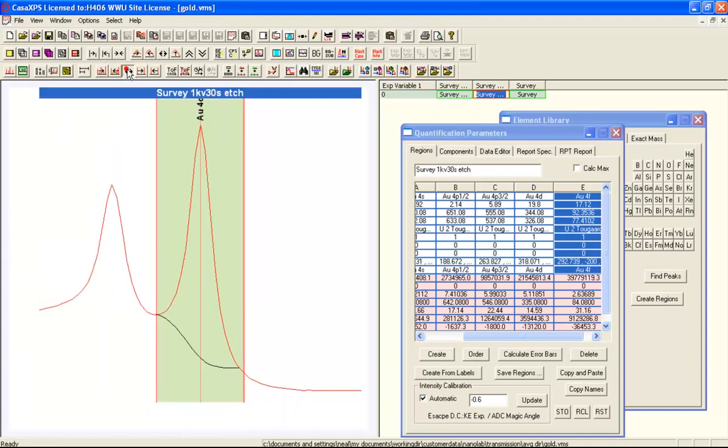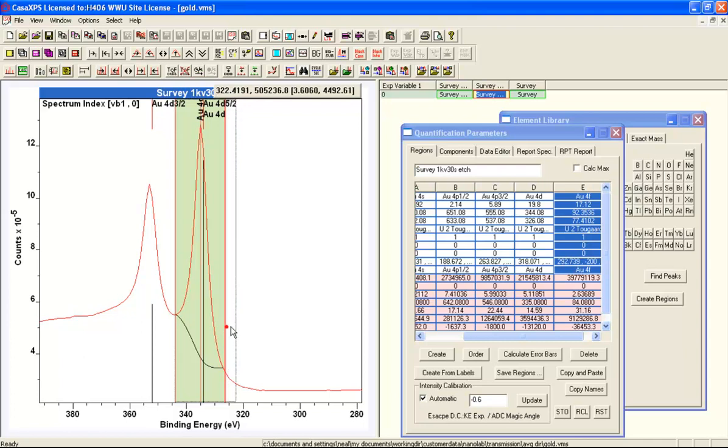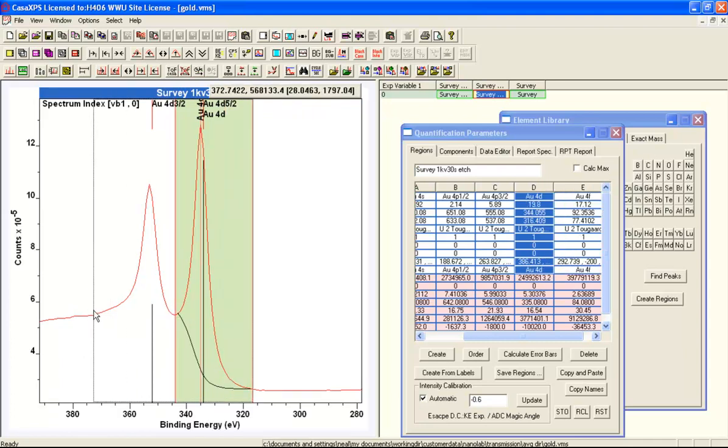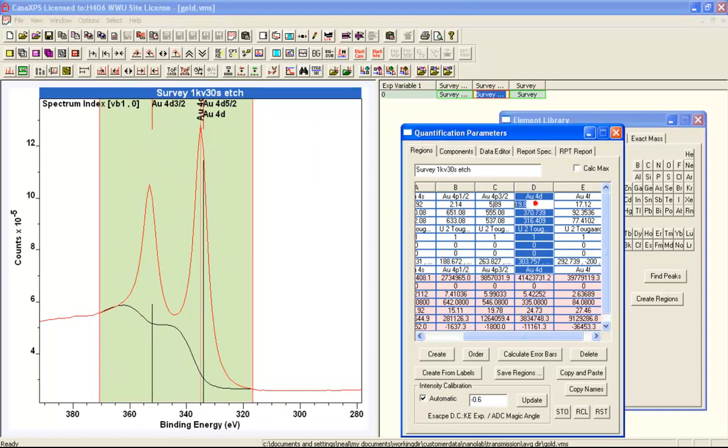Here we've got, it's indicated the gold 4D. The RSF says gold 4D, so the peak itself has turned out to be the 5 halves peak. That would be inappropriate for that RSF. So we'll adjust this and take in both parts of this doublet because that's the appropriate RSF for the 4D as a total RSF.